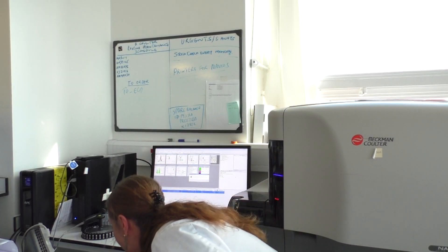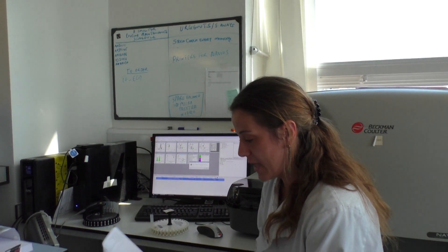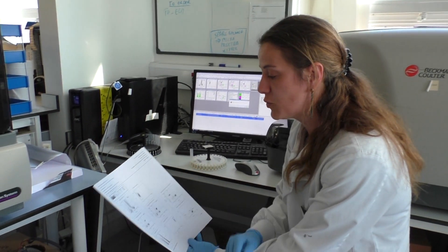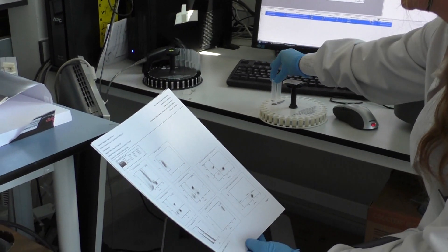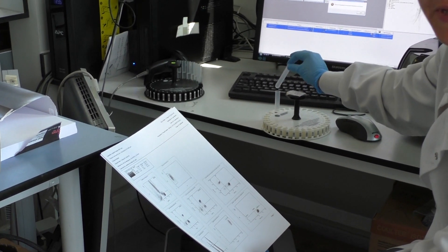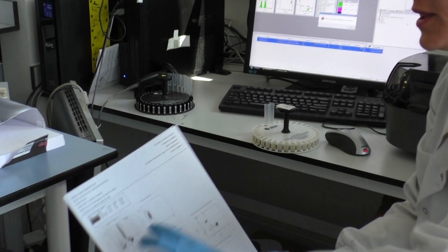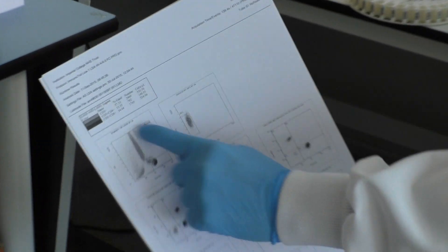We need to check the charts. We print one page for the results of the T cells because you will have two tubes here - I'll be looking for T cells on the first tube and B cells on the second tube. These show me exactly the total amount of white cells.